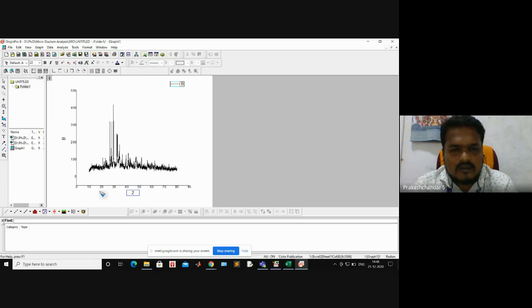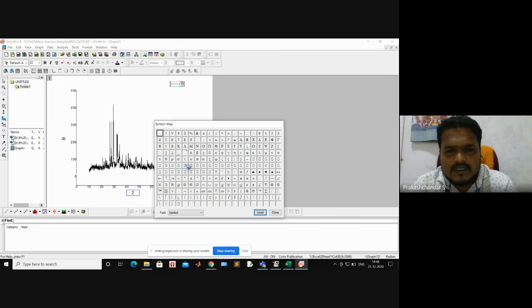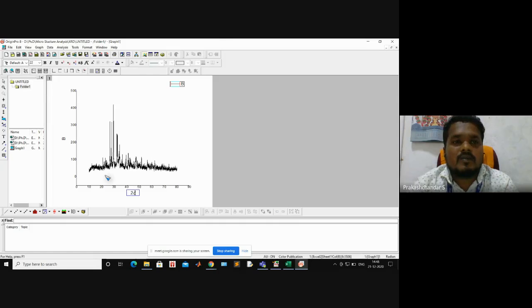2 theta. Okay, 2 theta. And here you can make it intensity. Okay, right click this one.